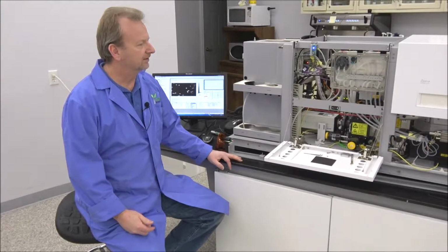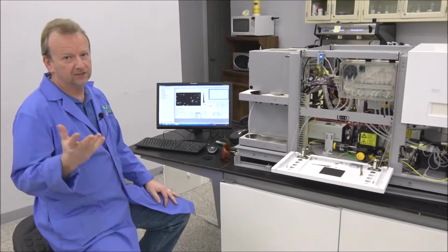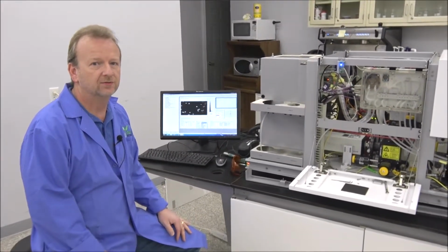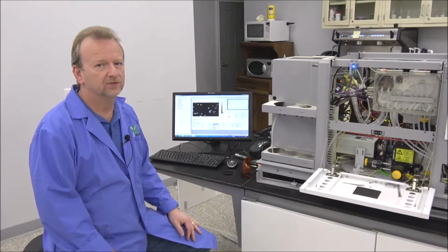All right, we're back to the Opera again. We've turned on the software and got it fired up. I know I've talked to you on Friday night through an email, and you said you were having trouble calibrating the lasers. And I kind of want to address that right away because I feel like that's probably the most important.